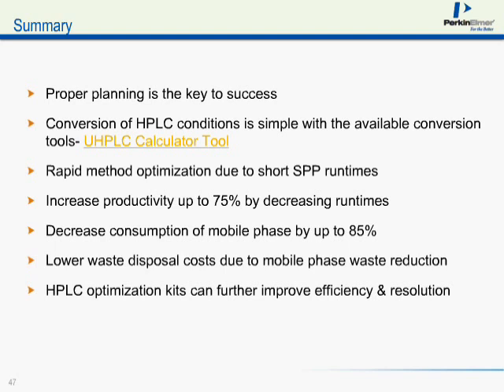I guess the point here is that, don't be scared to convert methods. It's not as hard or difficult as you would think they are. And the columns themselves and the short run times will save you a lot of money and improve your productivity as well.